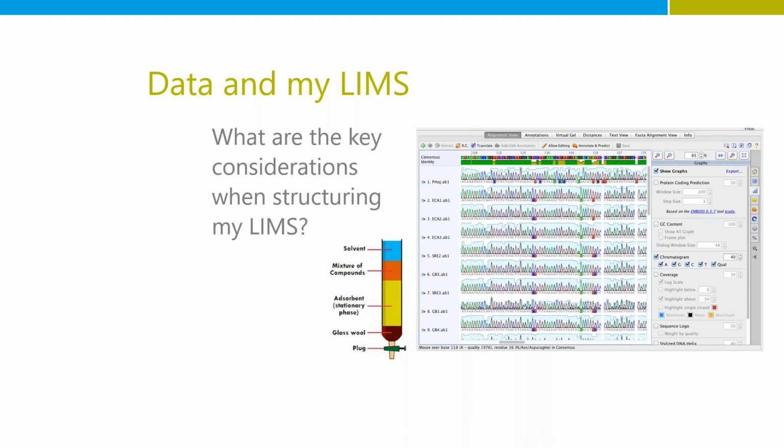As far as I see LIMS systems, there are two major concepts you want to take an approach towards, and that's scalability and abstractions. So what does that mean? Scalability means you can continue to grow your business and handle more tests, and abstractions gives you the capability to potentially pivot into other industries or adapt to your own changing industries. So you want to make sure you have those things covered, and that extensibility that Bill had mentioned will help you succeed better as a business.